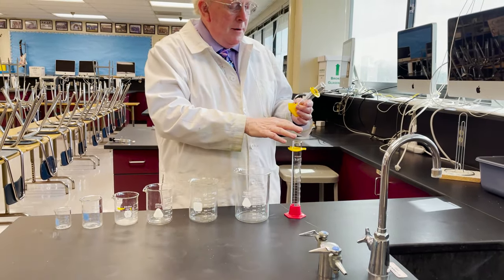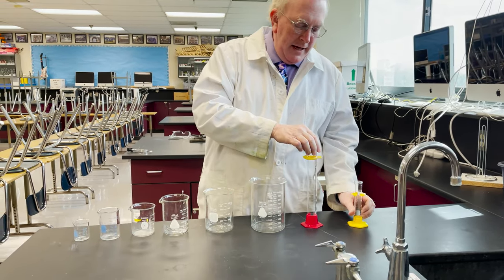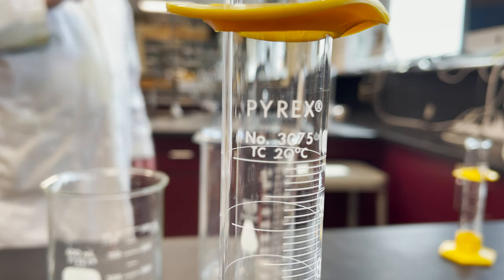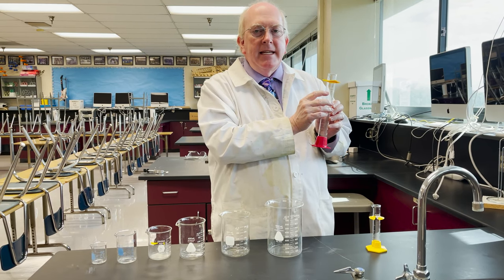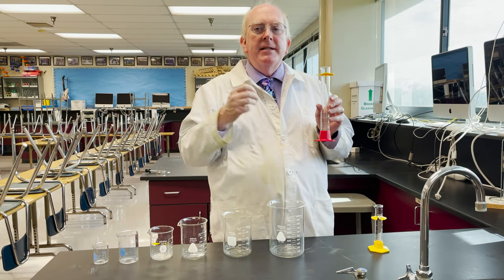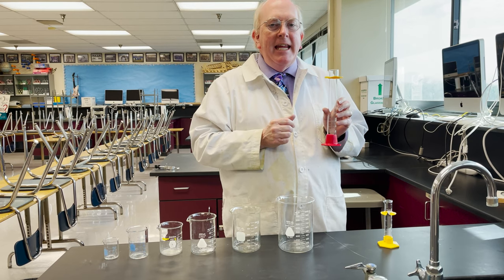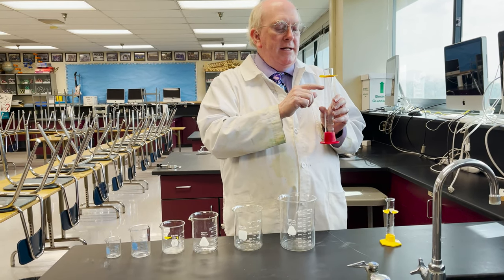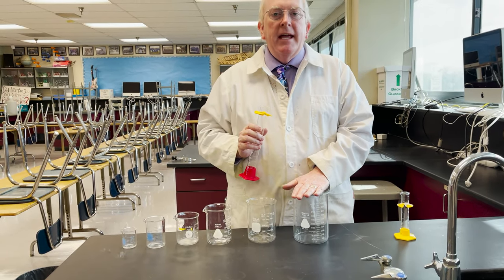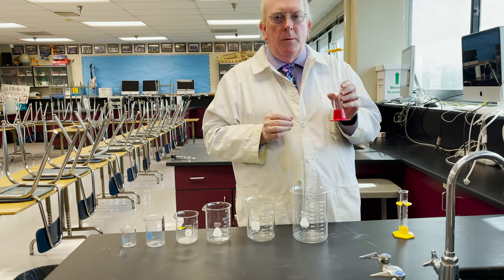Graduated cylinders, you will notice, are much narrower. They have a scale on them also, and sometimes you will see them with the letters TC or TD. TC means 'to contain' — so if you have it exactly on 100 milliliters, that means it contains 100 milliliters. TD means 'to deliver' — so if it has 100 milliliters and you pour it out, you're going to get exactly 100 milliliters in the other container, because there'll always be a little bit left behind on the walls.